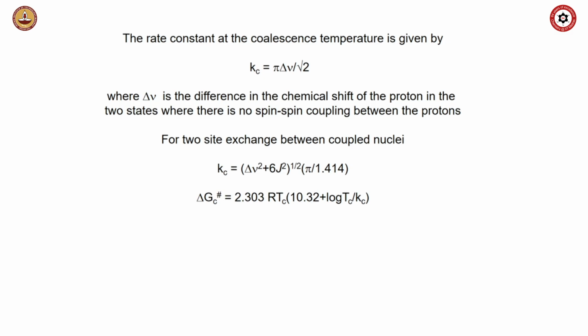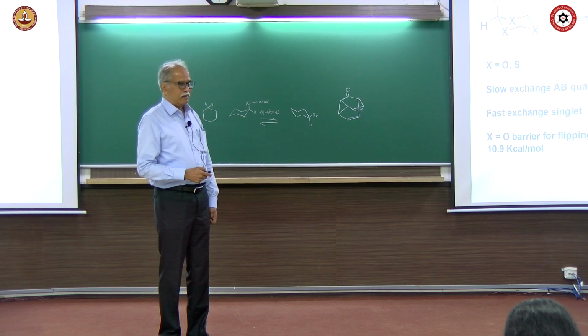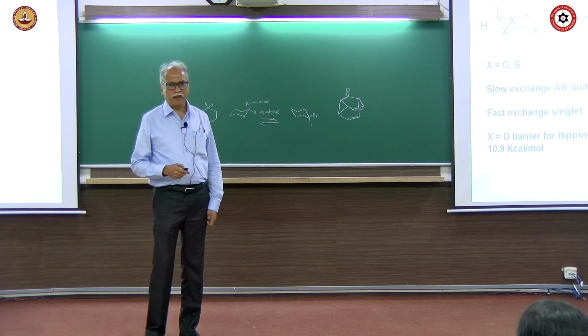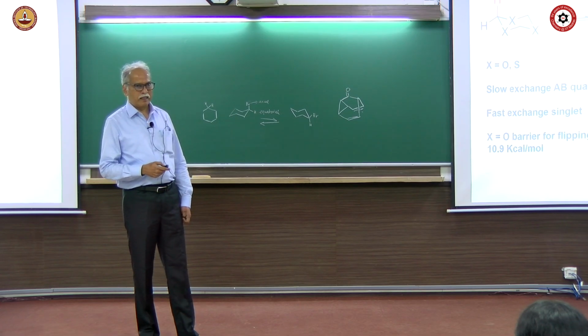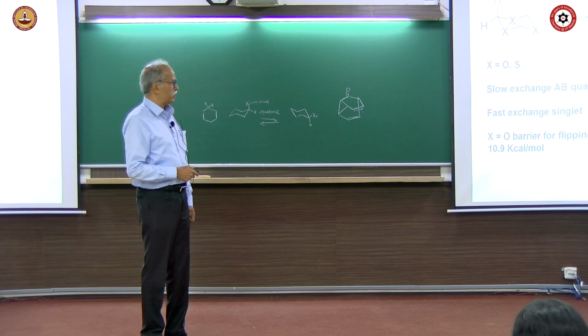Or if you want to do an elaborate study, you can do a calculation of the NMR spectrum and arrive at the calculated spectrum, and look at the similarity between the calculated spectrum and the experimental spectrum.